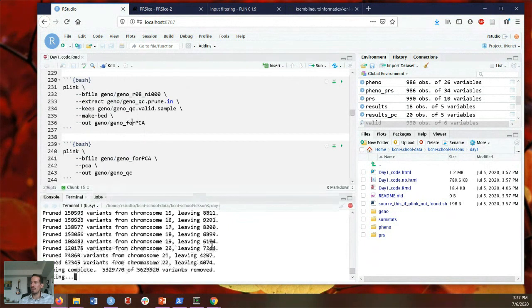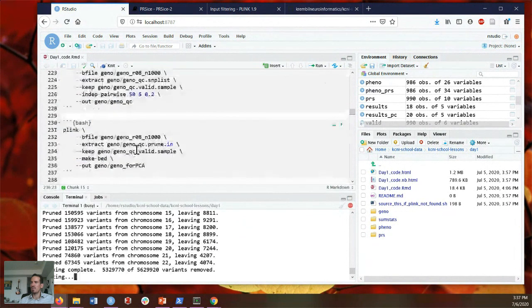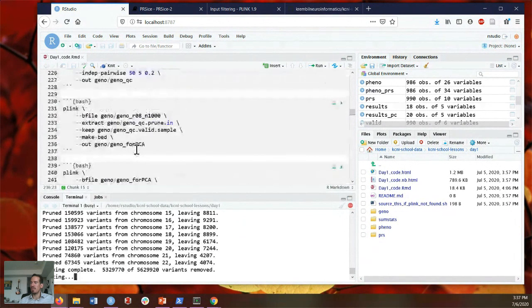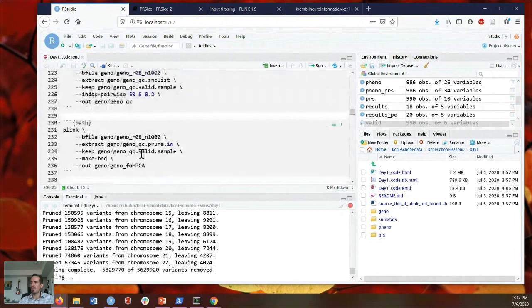So it says writing. I suppose it's taking its time. It's really quite remarkable, actually, how much the process is slowed by performing this live broadcast. I should get my resource manager out and see the types of demands on the CPU from this Docker versus the Crowdcast.